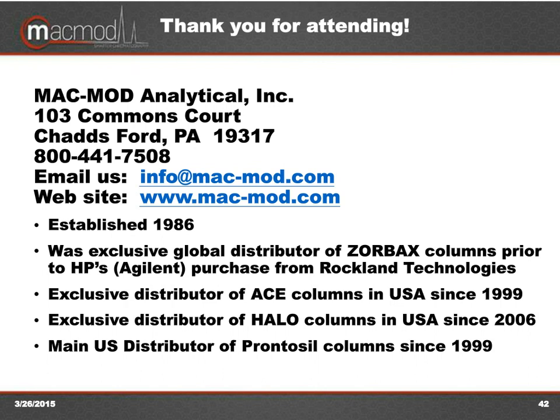So using two columns with different selectivity in tandem probably goes beyond the scope of this seminar or webinar, but I'd be happy to answer that one afterward. But that was not my intention in mentioning that. Those were the same phase in the same geometry, or maybe even a shorter geometry, but ideally to multiply the amount of resolving power that you have.